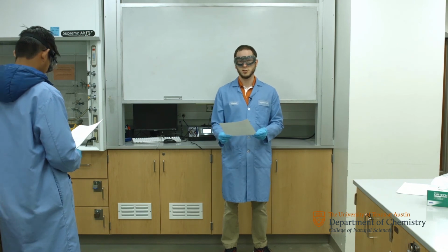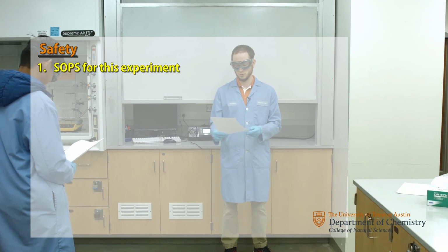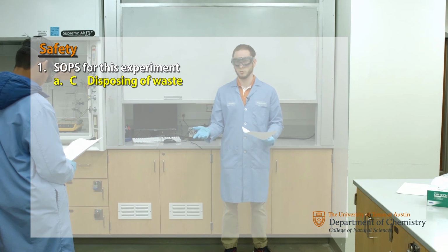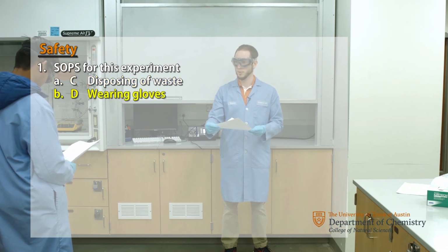So for every lab, safety is paramount. So you're going to want to make sure you follow standard operating procedure for this experiment. Disposing of waste. All of the waste that's going to be generated in this lab is non-halogenated organic waste. So be sure and dispose it in the proper bin over by the waste disposal. You're going to be wearing gloves for this experiment.